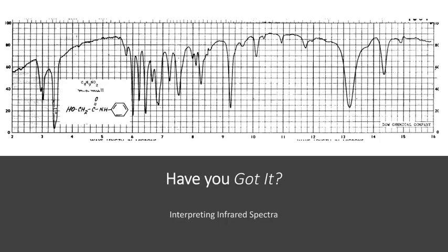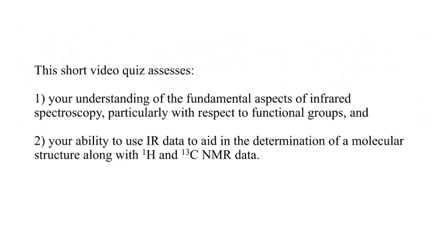Interpreting infrared spectra. Have you got it? This short video quiz assesses your understanding of the fundamental aspects of infrared spectroscopy, particularly with respect to functional groups, and your ability to use IR data to aid in the determination of a molecular structure along with proton and C13 NMR data.